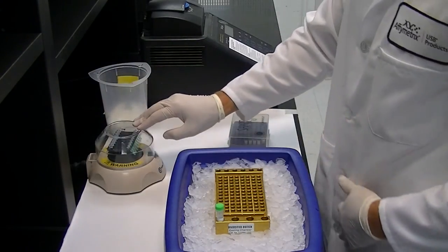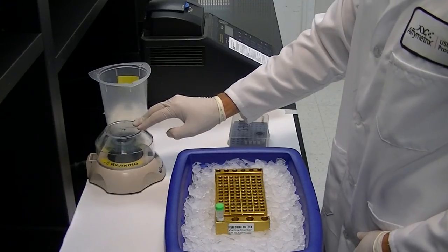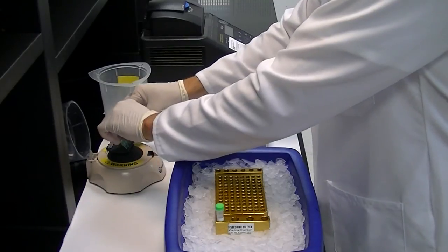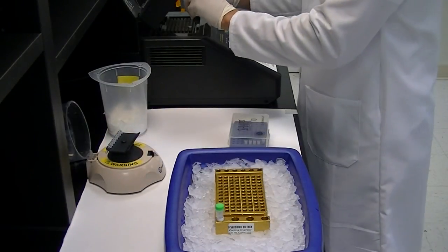Briefly spin the tubes to collect the contents, and place the samples in a thermocycler set to incubate for 15 minutes at 37 degrees, then 15 minutes at 80 degrees, followed by a hold at 4 degrees Celsius.